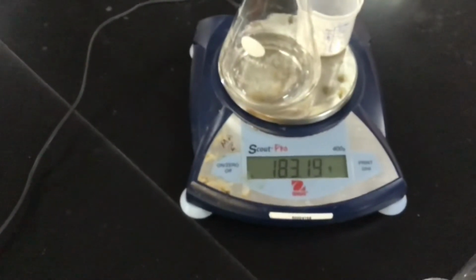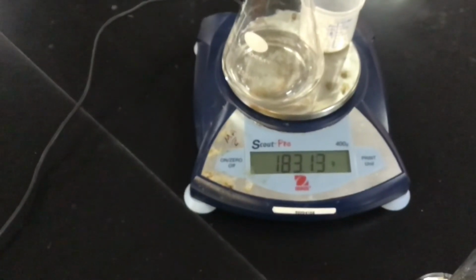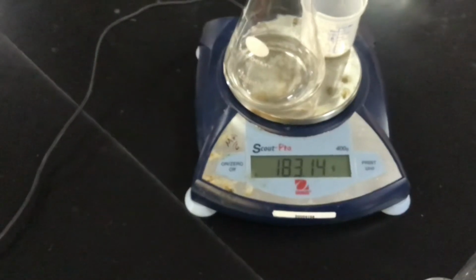Set that up on the scales. Fluctuating a bit. 183.15, we'll call that. So 2.5 M, 183.15.